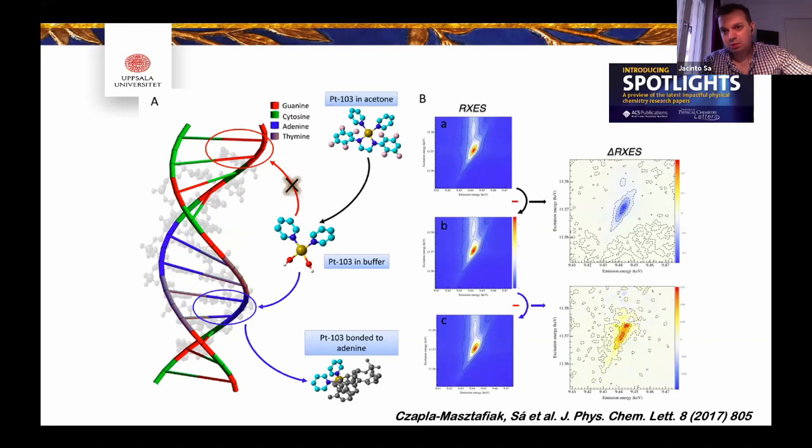Okay. Yeah, the reason I was wondering is I was just wondering if you went to a Johansson that was just a little bit off circle, so you were taking a narrower band of the emission, you might be able to get the data even more quickly. Yeah. By focusing the energy bandwidth just at the energies that you care about. But the data is beautiful.